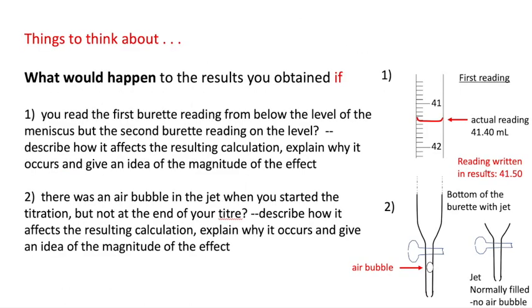What would happen if, so you've got an incorrect burette reading, you're reading from below the level of the meniscus. So what would that do to your final calculation? And you can apply this to the percentage of calcium carbonate in the eggshell. But obviously would apply to any titration that you do. And the second one is if you have an air bubble in the jet, so you haven't actually completely filled the jet, which you normally do. So what's going to happen when you turn the tap on, what's going to happen to your actual results of your calculation?